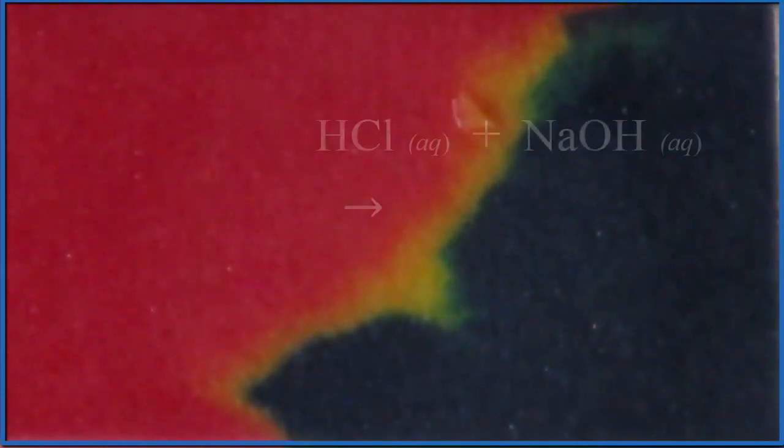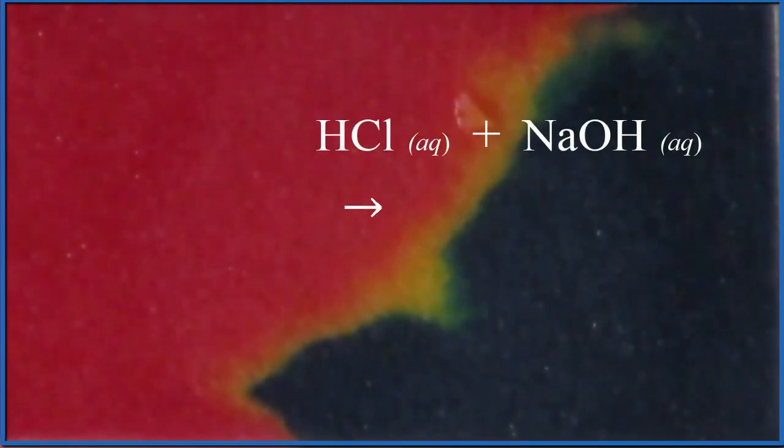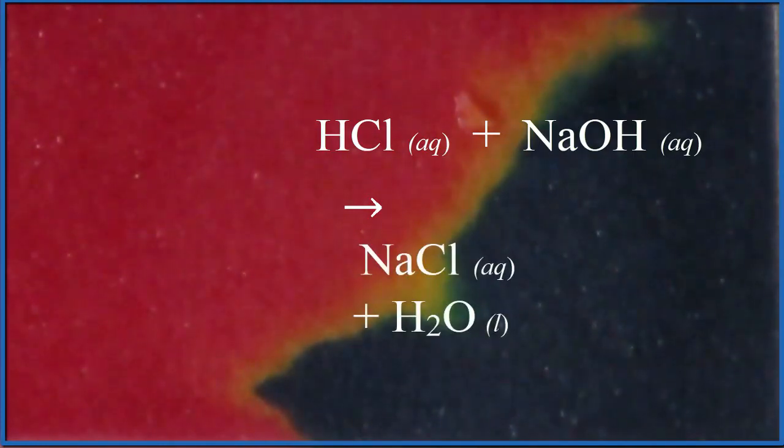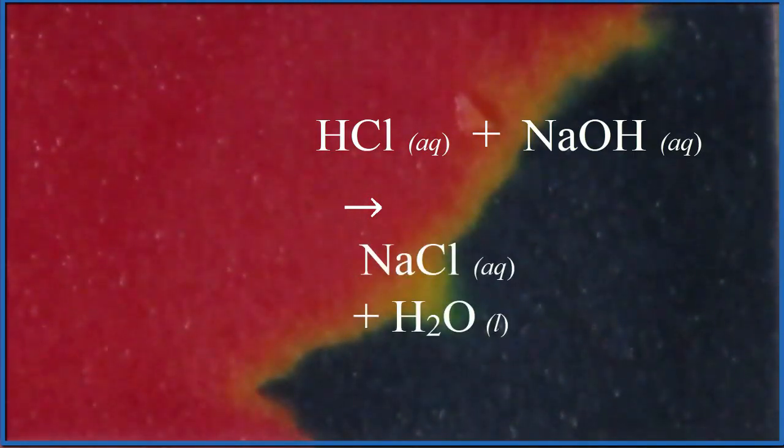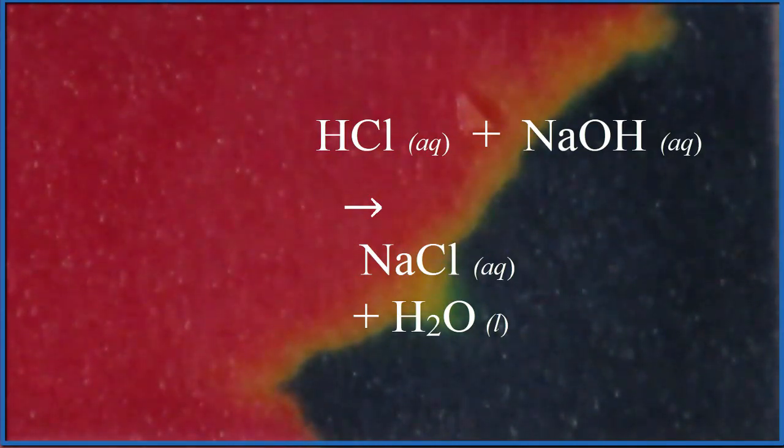So what's happening is the hydrochloric acid and the sodium hydroxide, they're neutralizing each other, producing salt water, NaCl plus H2O. And that has a pH of 7. You can speed it up.